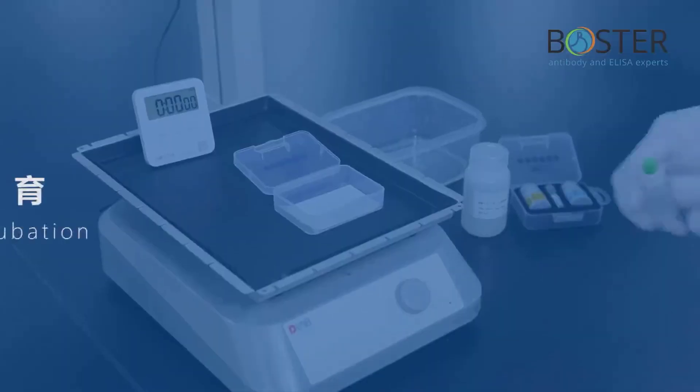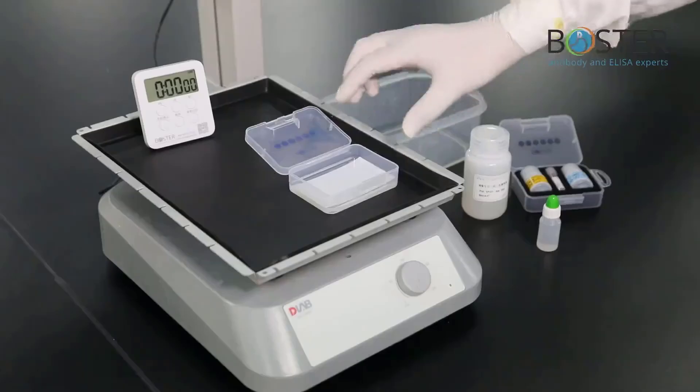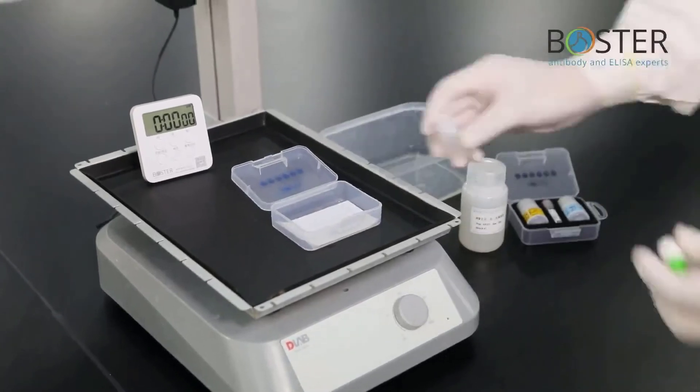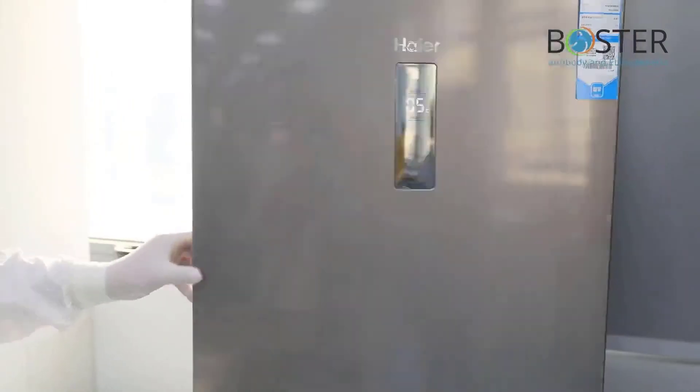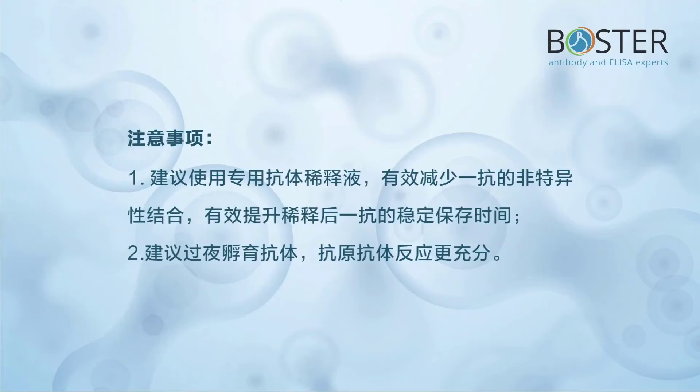Step 10: Antibody incubation. These are the products needed for antibody incubation. Pour off blocking solution and add primary antibody. Put in refrigerator and incubate overnight at 4°C. Precautions: it is recommended to use a dedicated antibody diluent to effectively reduce non-specific binding of the primary antibody, improve the dilution ratio, and increase the stable storage time of the primary antibody after dilution. It is recommended to incubate the antibody overnight for a more adequate antigen-antibody reaction.